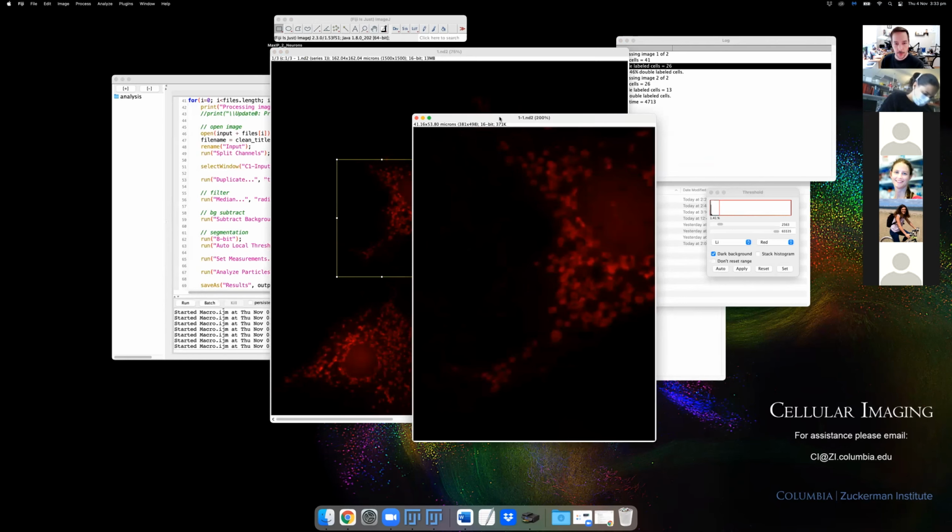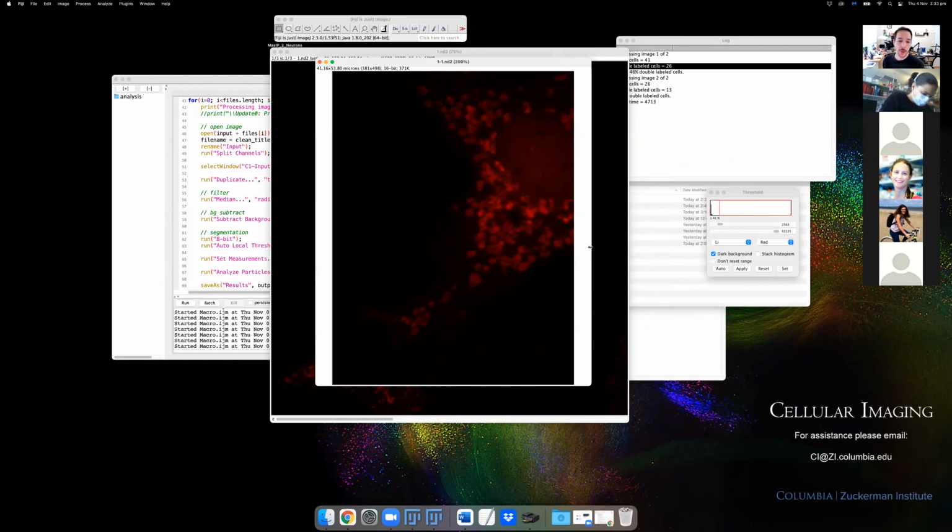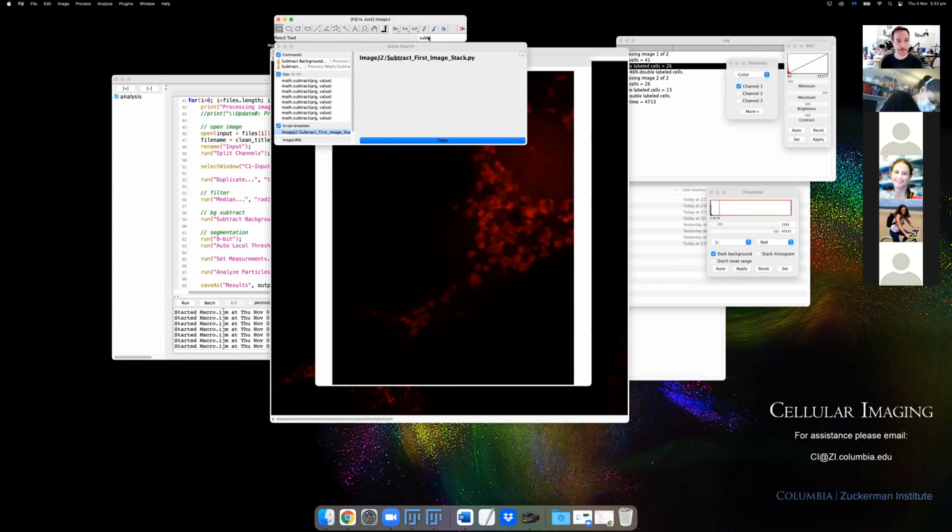And this is using the water objective. If we were really trying to analyze the mitochondria, we'd probably use the 100x objective on this spinning disk, but it's good enough that you can see the mitochondria fairly clearly, but not clear enough to get a nice segmentation result. So the first thing that I would probably do is we want to get rid of the background. We've got this low frequency stuff in the background here. We can just use a subtract background to get rid of this.